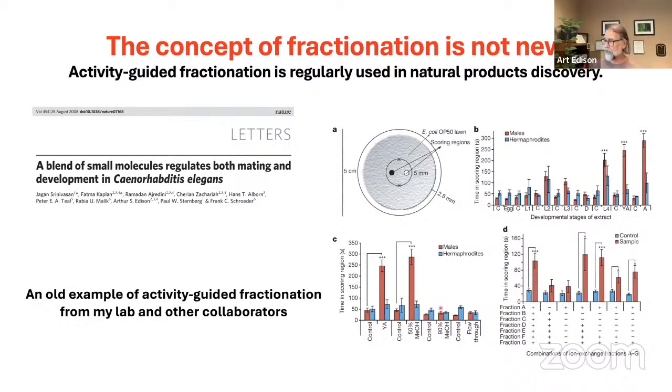We got rid of a lot of compounds in that process. And then, using the same kind of approach, we started to purify this 50% methanol and test it for activity with other types of separations, a lot of ion exchange, for example. And we tested every single fraction that we were able to obtain, and things got more complicated after the initial stop, but we were able to follow fractions that had activity, that males were attracted to the material.